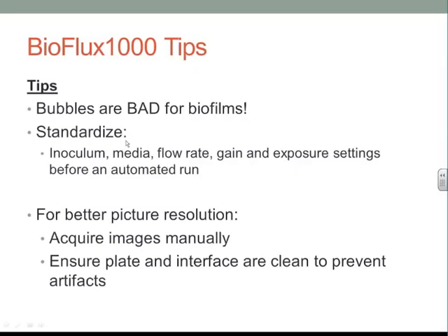Additionally, this sounds like a no-duh thing, but you need to really ensure that the plate, this is basic microscope 101, I realize this, but your interface sometimes can get condensation on it, and any type of condensation can make your images skewed a little bit, and you can really decrease your picture resolution. Just keep some of these things in mind.